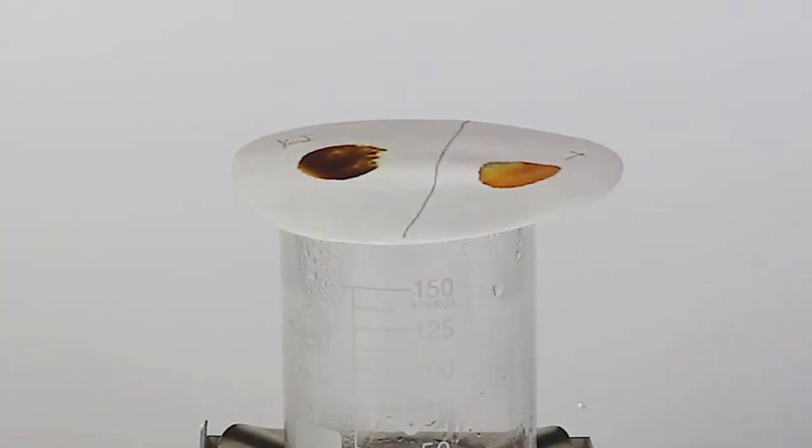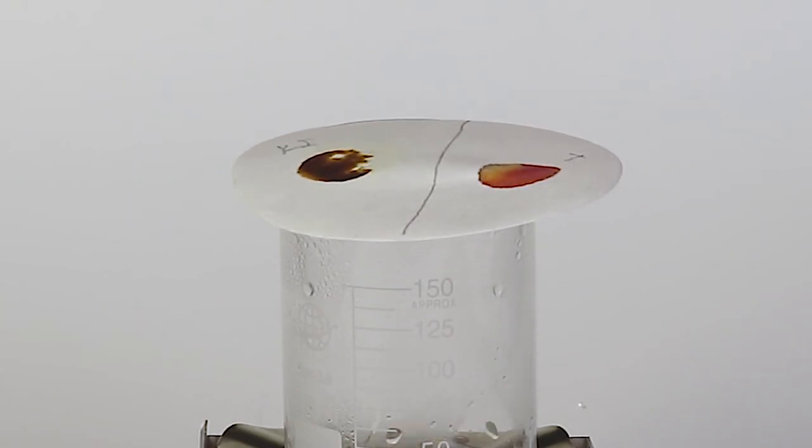On the second half of the filter paper, chlorine reacts with potassium iodide. This reaction produces potassium chloride and molecular iodine. It is the iodine which gives the drop its brown color.